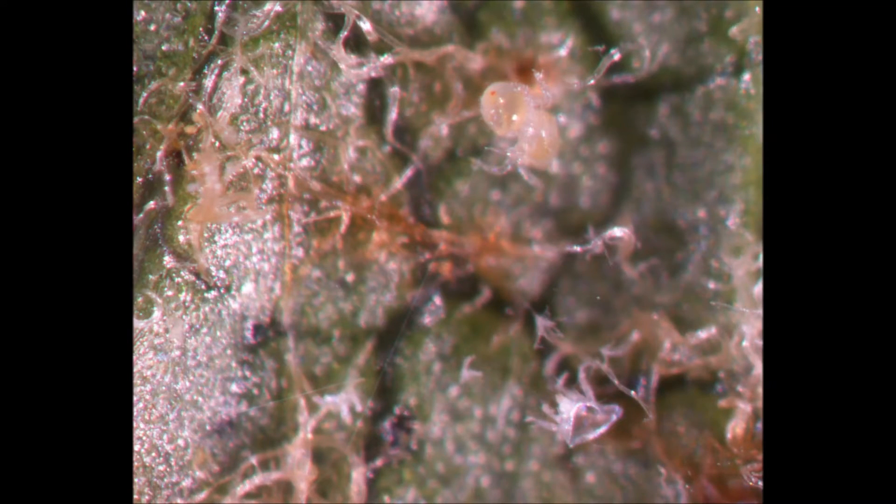A younger mite, likely a deutonymphe or the last nymphal stage of the life cycle of predatory mites, can be seen here feeding on a two-spotted spider mite egg. This egg is very mature, as you can see the two eye spots of the larvae developing within.